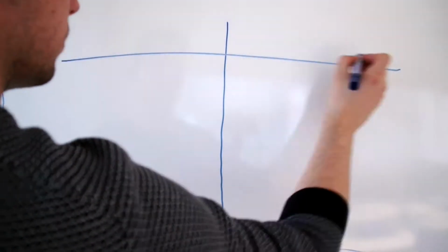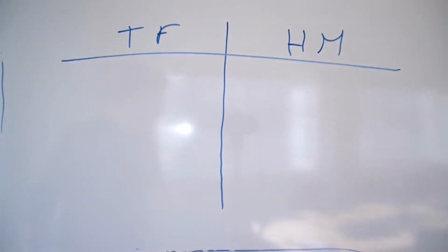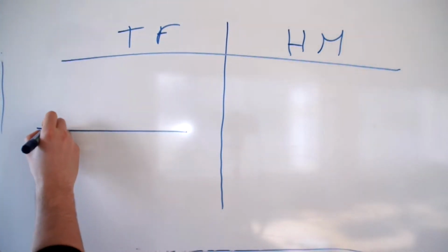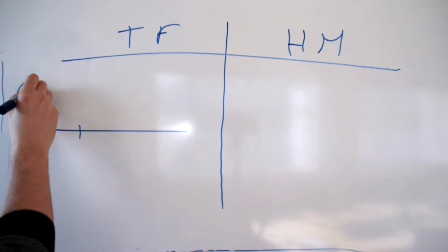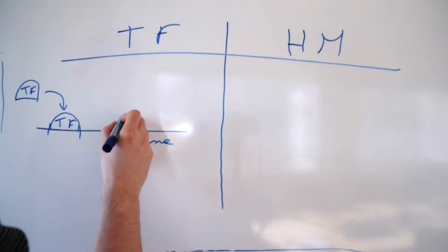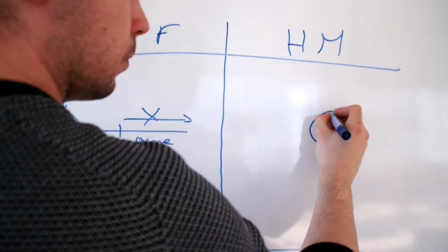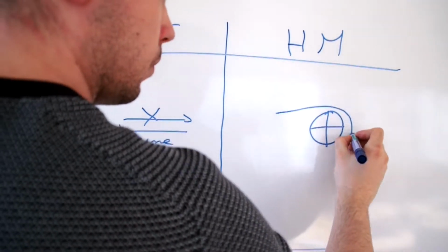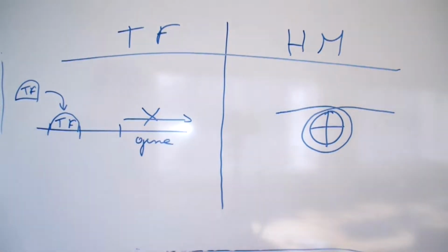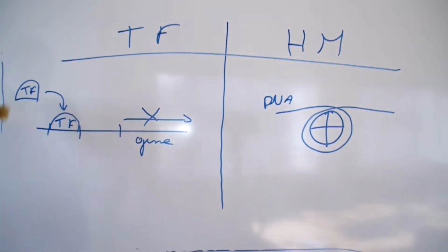There are two types of proteins that we can be looking at when we are doing ChIP sequencing: the transcription factors and the histones. The transcription factors are proteins that bind to the genome and interact with the gene. They can enhance and repress a gene and have some other functions. The histones are a group of proteins that are attached together and around which the DNA will wrap to be folded. In the case of histones, we can study the effect of modifications on the folding of DNA.